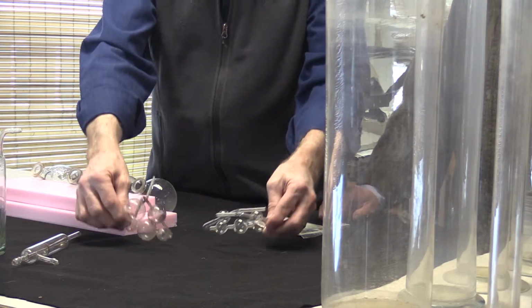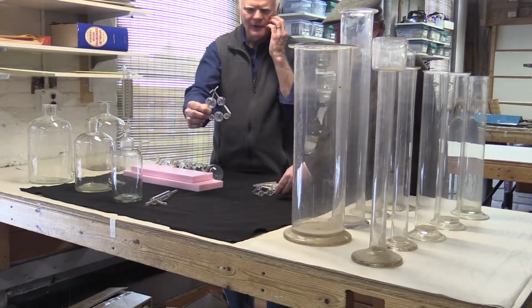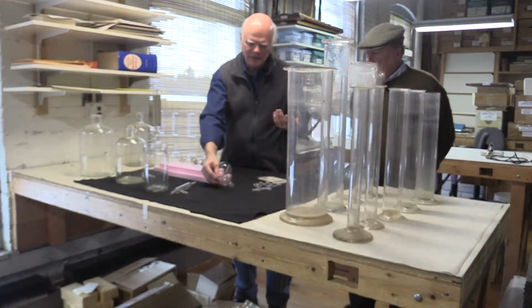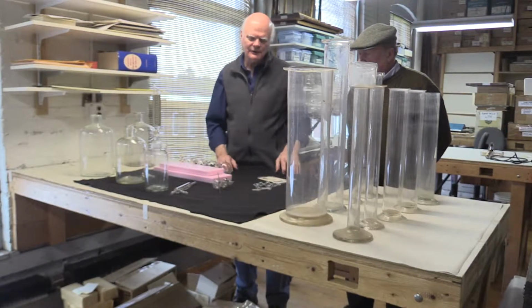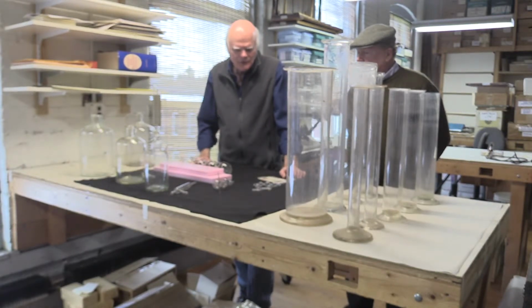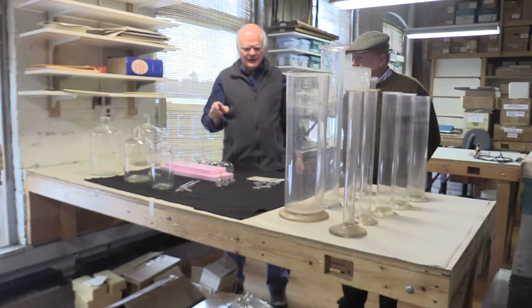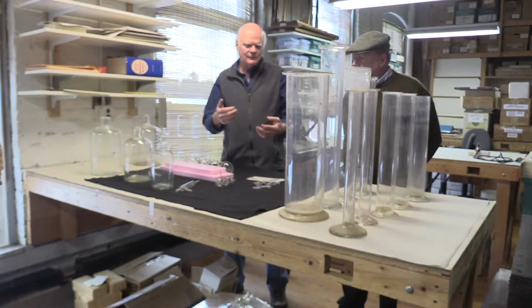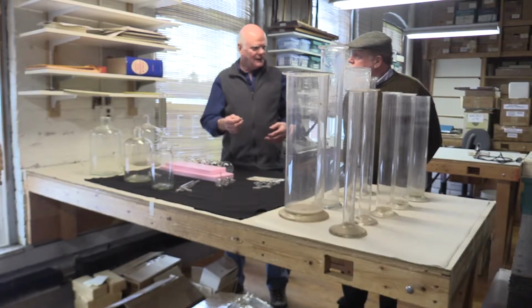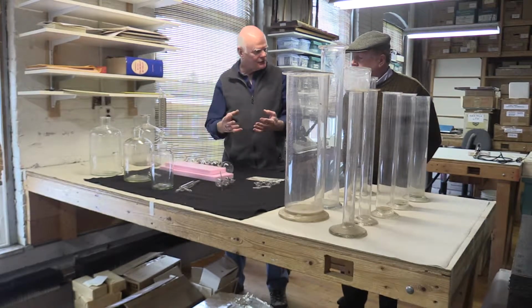You can see it's a thinner kind of glass. It's still very light, like a feather. That's what they did with glass through the 1800s. I've talked with curators from collections all over the world. I've gone to conferences on scientific apparatus in university collections. Saiku is the name of the organization. It's hard to date chemical apparatus, but through the 1800s, the way they gave it more thermal resistance to heat changes was to make it thinner and thinner. But that made it weak mechanically. You'd wrap it on something and it would just shatter.